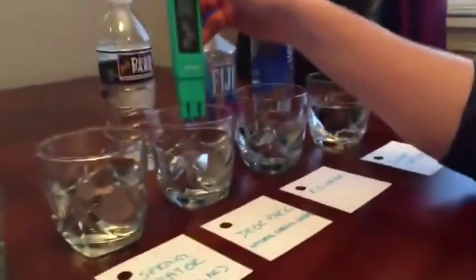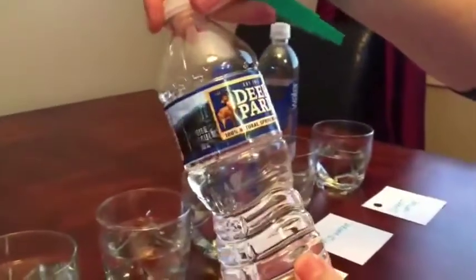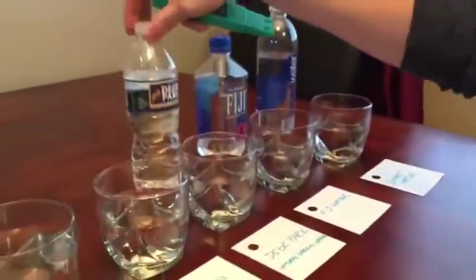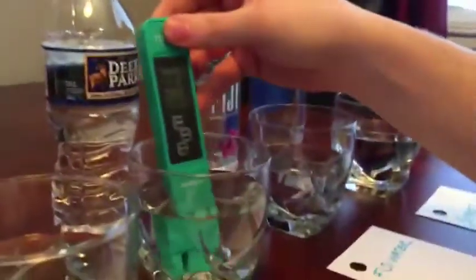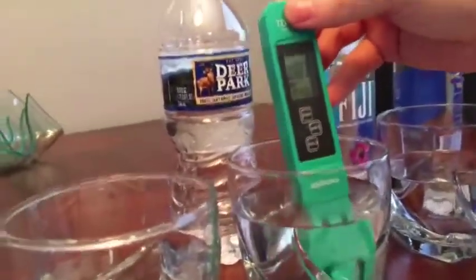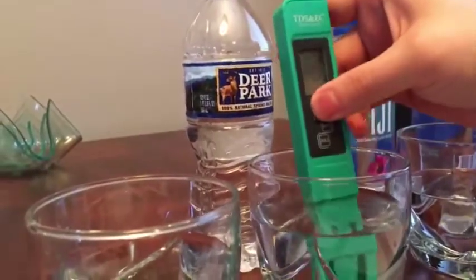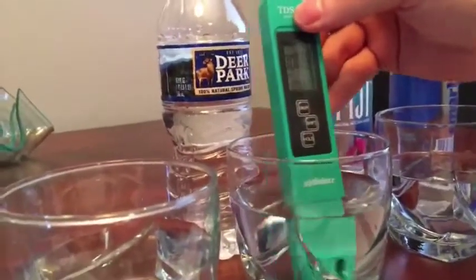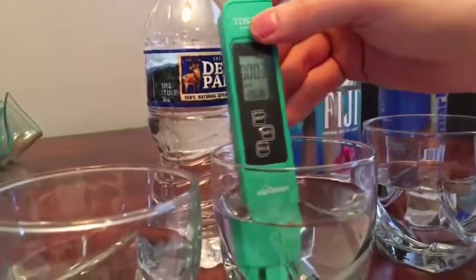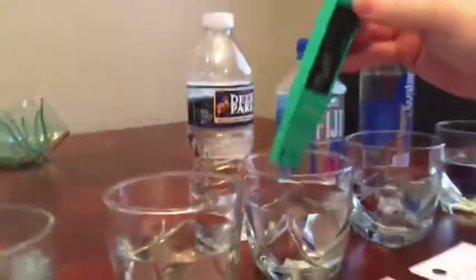Now here is Deer Park 100% natural spring water for comparison. We're getting a reading of about three parts per million — the Marshall, NC spring water was two parts per million, so these are very close. This tells us Deer Park is using true natural spring water without many additives. This tool will tell you if your spring water has additives. Note: the meter has an auto shut-off feature.